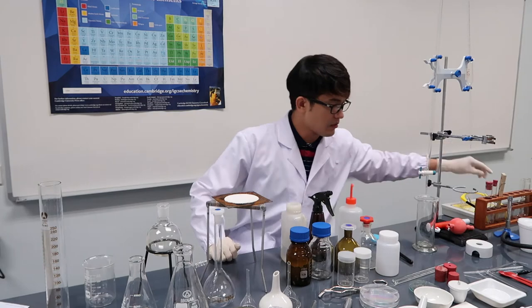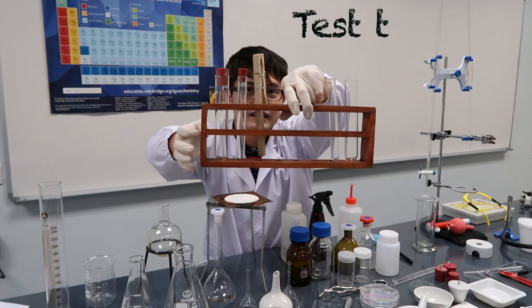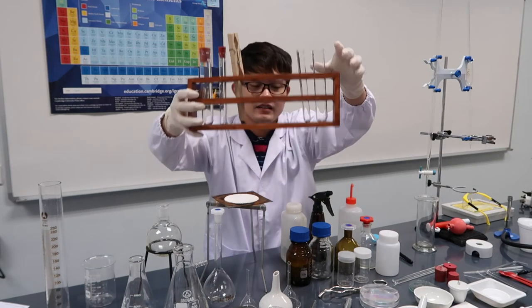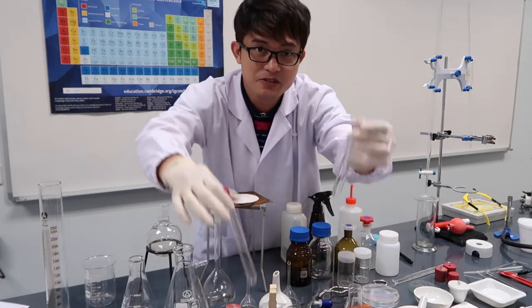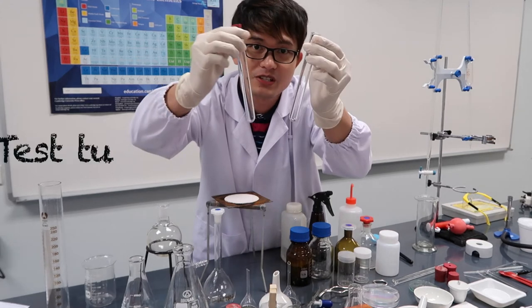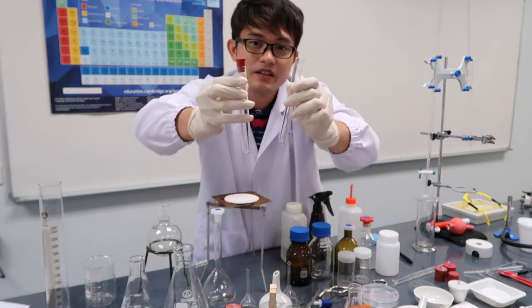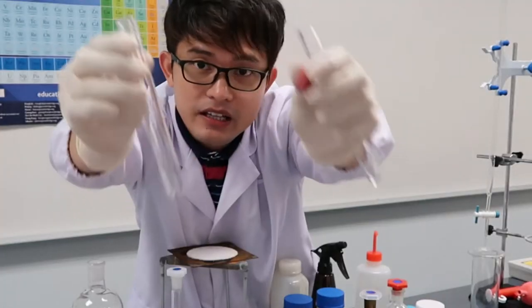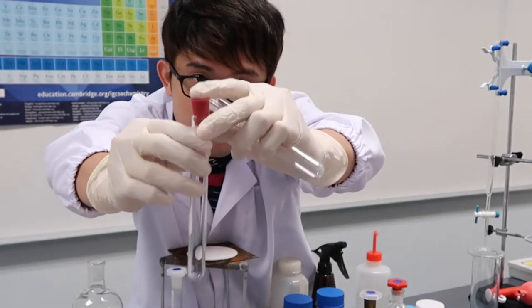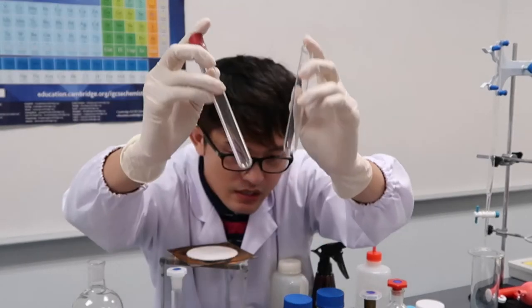Of course we have the test tube rack, and inside it we have test tubes. This is the most common piece of equipment — this is where we do some chemical testings. Here is a test tube with a rubber stopper, and these are ordinary test tubes.